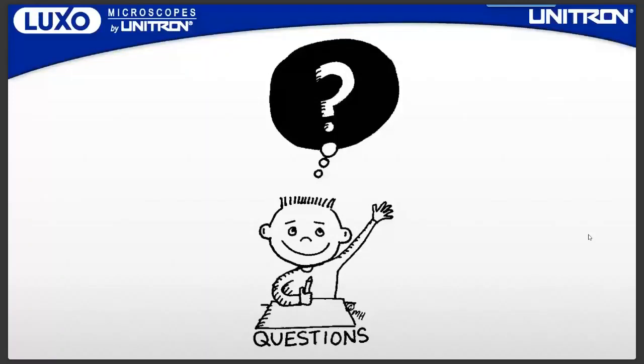I can tell you that the Omni Core starts at 7,000, and then there's options for stands and the applications and lighting and so forth. So it goes up from that point. But as we mentioned at the very beginning, it's really customizable. So you buy what you need, and that way you're much more flexible with your need and your budget.